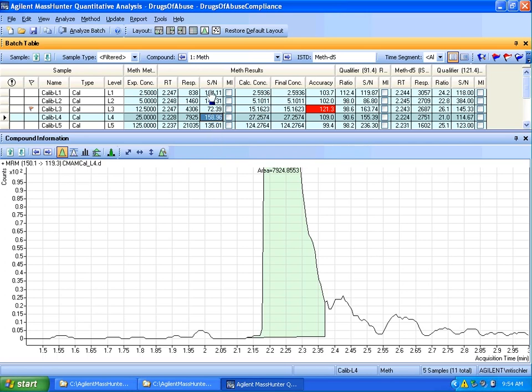And that's what you're going to see here, and a reasonable explanation as to why the signal to noise does jump around. So I'd like to mention that folks have looked at calibration curves and expect this to be very linear in the signal to noise calculation. The expectations from the design were that the use of signal to noise would mainly be focused on looking for peaks that had a very low signal to noise and looking at the integration quality of those peaks. And the metric is very useful in that regard.